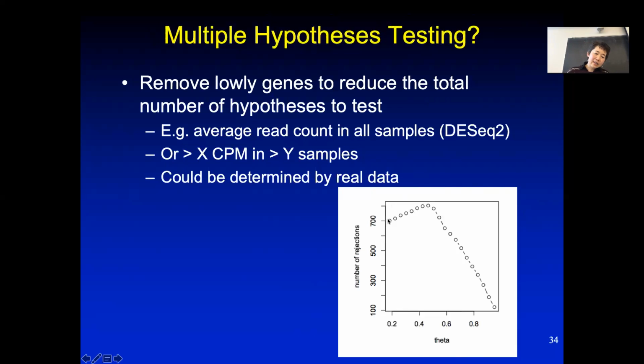And then they ask, at the same 5% FDR cutoff, am I able to call more genes as differentially expressed? And you can see here, initially, if you don't do any cutoff, maybe you don't do so well, but as you increase your cutoff and start to eliminate those genes, at the same FDR cutoff you are able to call more genes as differentially expressed.